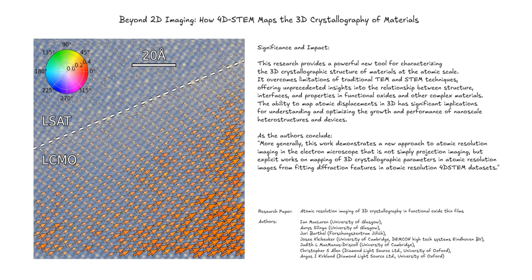The field of atomic resolution imaging and crystallography is constantly evolving, and there are several exciting avenues for future research and development. One area of focus is improving the resolution and sensitivity of 4D STEM. Researchers are working on developing new electron optics and detectors that can capture even finer details of atomic arrangements.